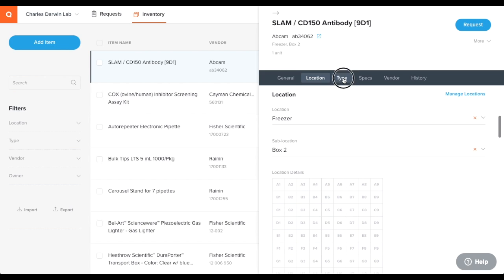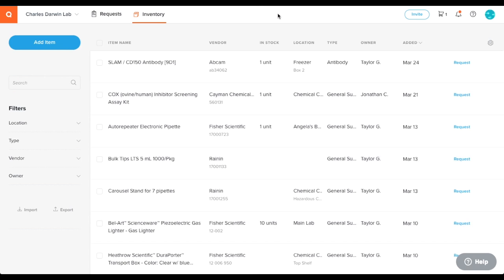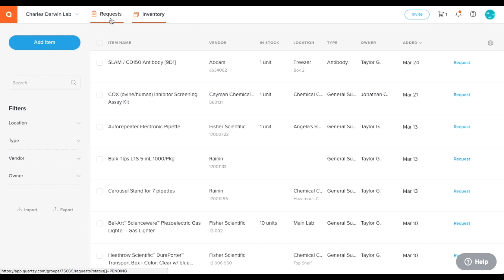When items are running low in the inventory, click the blue request button to communicate that more of the item is needed. This action adds a request to the requests module and the group admin is notified that the item needs to be ordered.